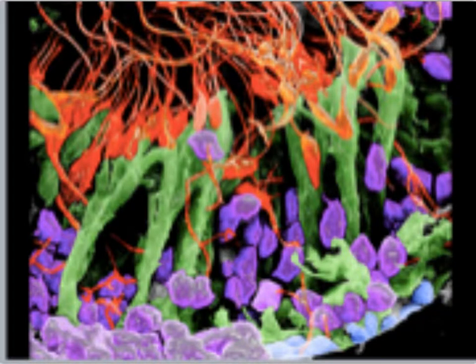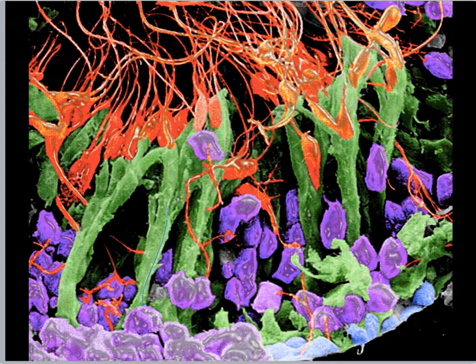All right, I like this slide because it's an electron scanning microscope slide, and they've colorized it so that you can see the different types of cells, so that you can see really nicely the sustentacular cells, which are creating these compartments, and these cells are in the compartments, okay? And then you've got down here the spermatogonium, and then you've got the spermatocytes, and then they're starting to paint the red ones, the spermatids, okay?